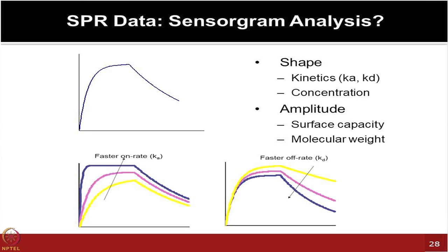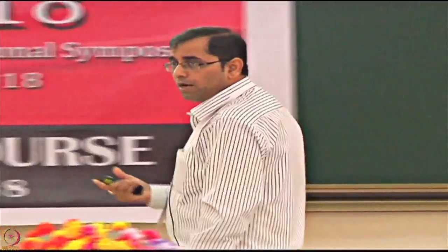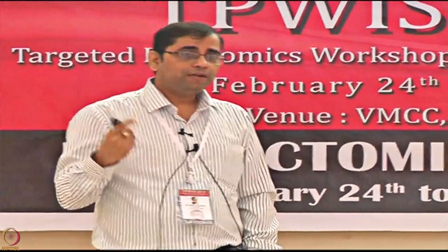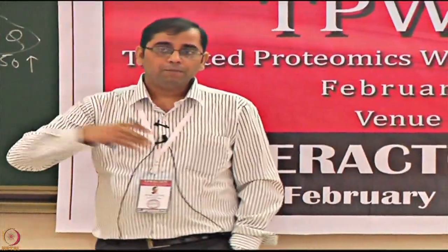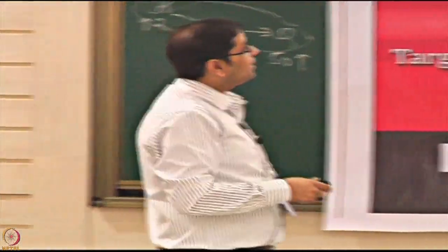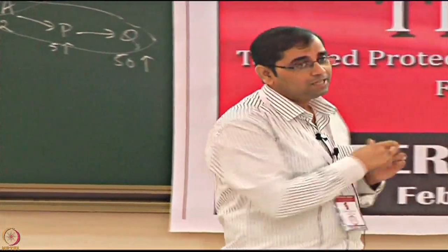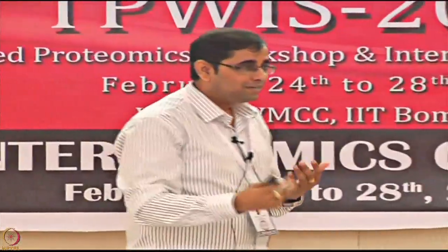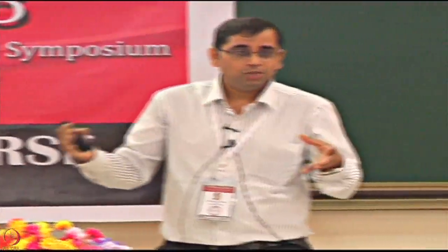So therefore these kind of curves are very crucial as you are watching, and there are many companies who work with us, who do the testing in our labs, in our facility, who are trying to look at many of their biosimilar products, and some of these kind of testing they do. We can see from their experiments that just looking at the shapes of these sensorgram curves can make them feel excited or not so excited, because immediately it tells them it is working or not working. So all of this is just visually what you are seeing.